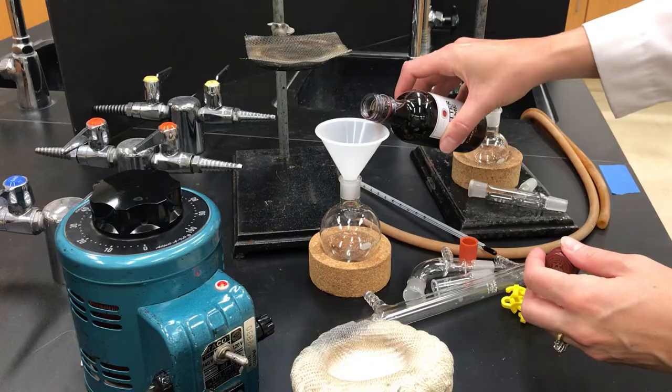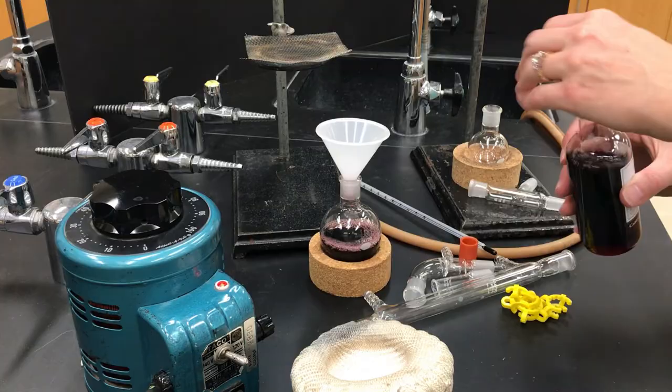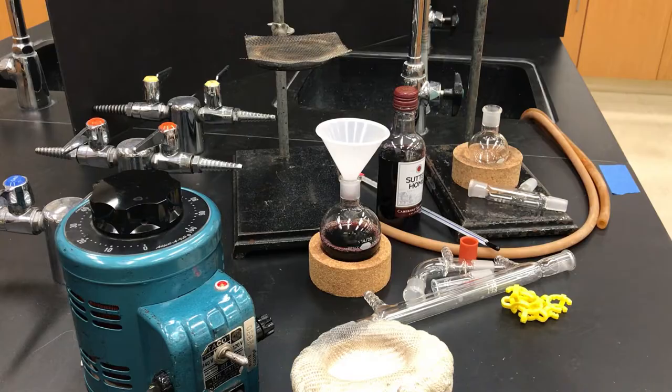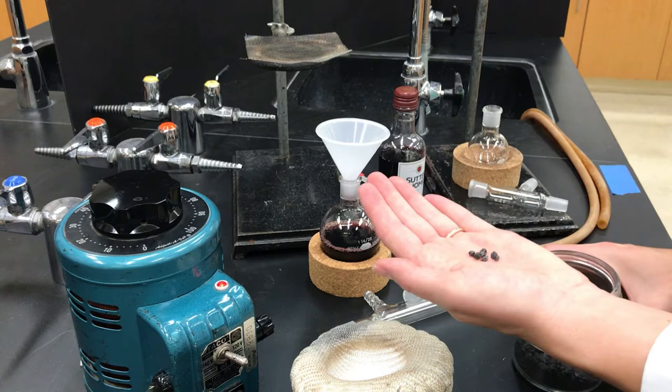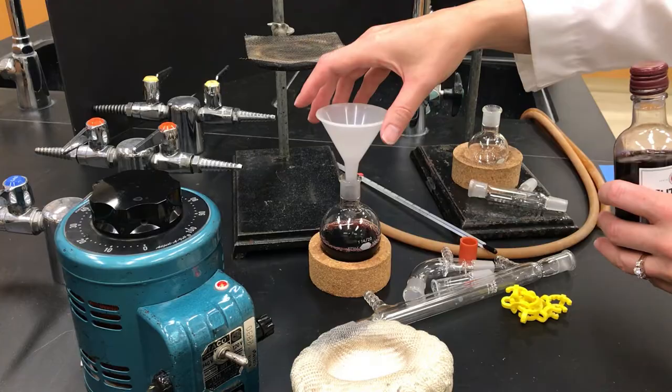The next thing I do is put the liquid to be distilled into a round bottom flask. Here I'm going to use red wine, so I'll just pour some in. Next I'm going to add some boiling stones. Boiling stones are little pieces of rock that ensure that your boiling is going to happen controllably, that you're not going to get bumps. Bumps just mean little bubbles that erupt really violently and uncontrollably and unexpectedly, so it ensures a smooth controlled boil. You just add a few of them.